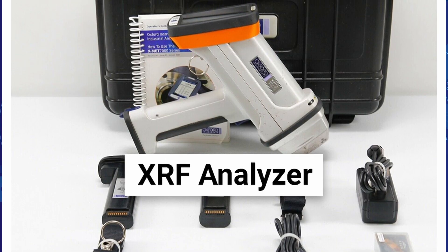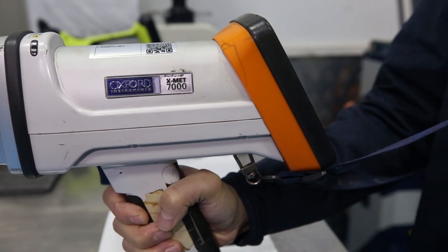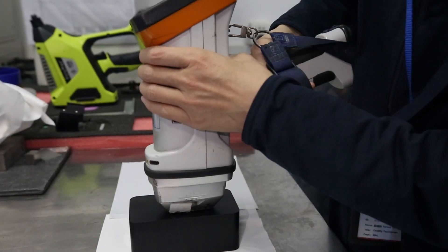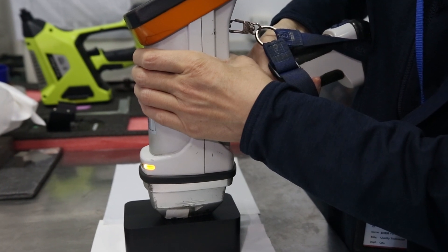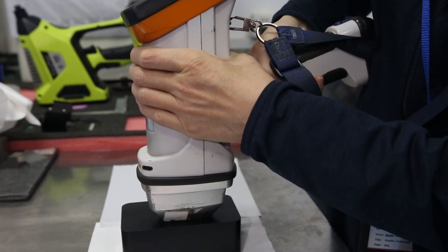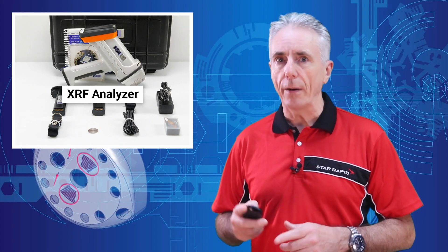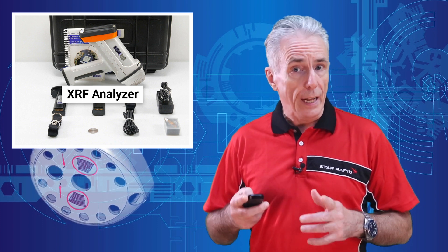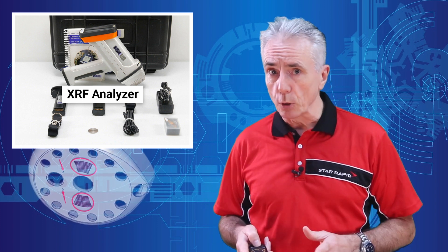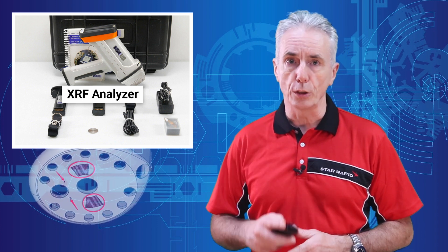X-ray fluorescence. This gun, which costs about $35,000, is normally used for PMI on metals, but it can also be used to find the four RoHS banned substances of lead, cadmium, mercury, and chromium. It can also see any other metals that might be lurking around in your plastics that shouldn't really be there. We cannot, however, see the difference between trivalent and hexavalent chromium, so you'd have to go to a lab and get a far more sophisticated test performed if you do find chromium where it shouldn't be.